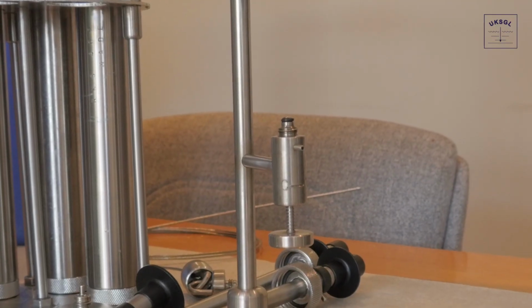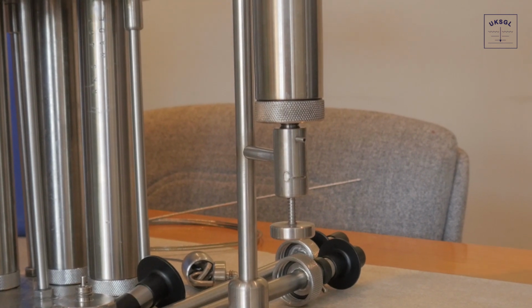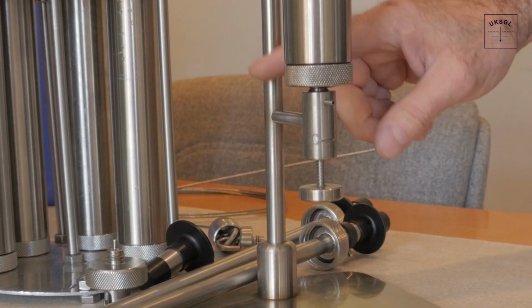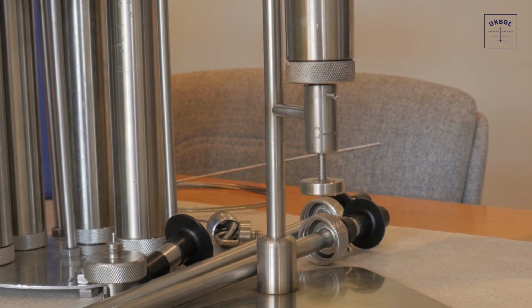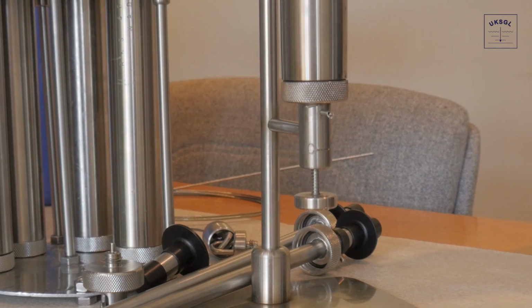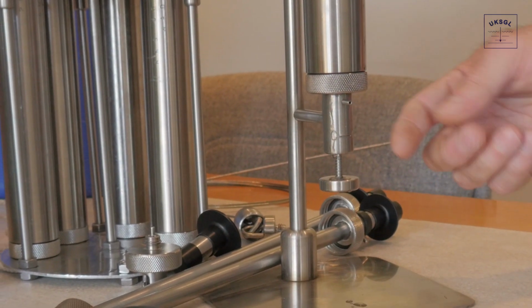At the lab, the tube is placed in the liquid extractor, with the black cap at the top. Then, the whole tube is rotated to screw the bottom non-return valve onto the extractor spigot. This will open the non-return valve. Not shown here, a thin pipe will be connected from the spigot outlet directly to the analyzer.